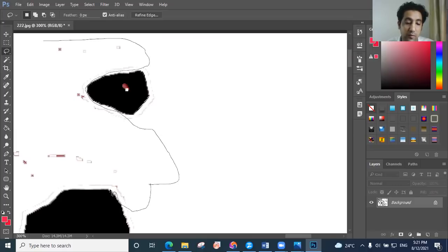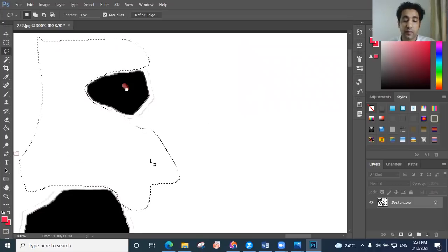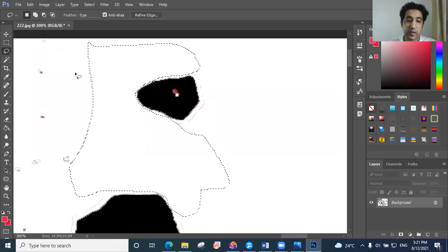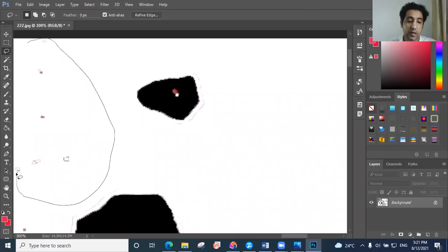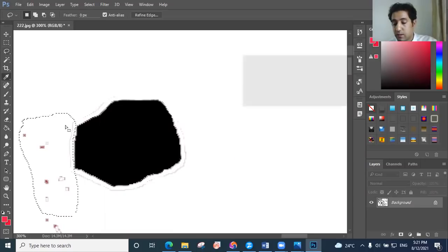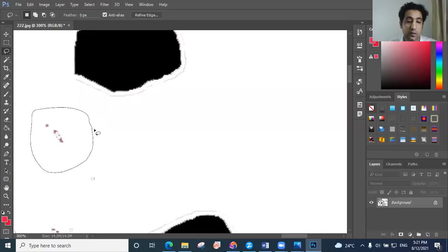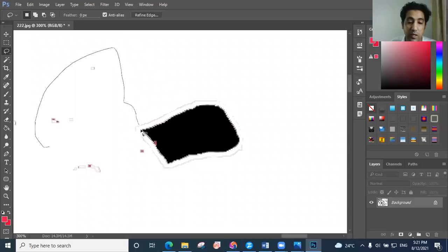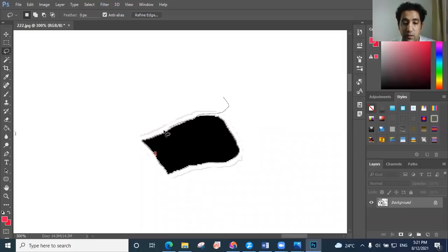You can make this a space, larger space, but not the grain. Delete. Then you can move down. We go step by step here. Right, we cleaned this and clean. It will take longer time, but it will give you an accurate result, and you can rely on the result you have. This is okay.